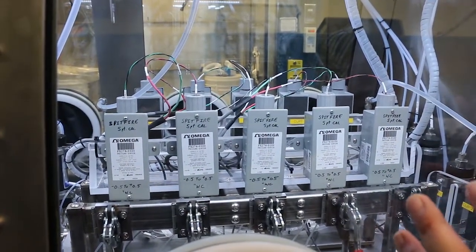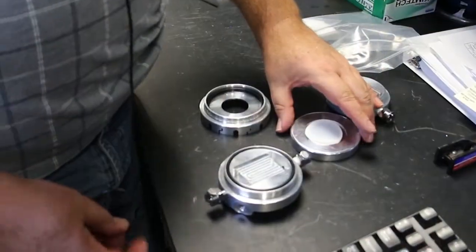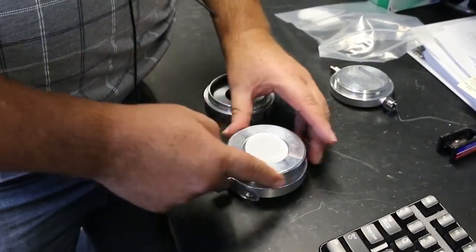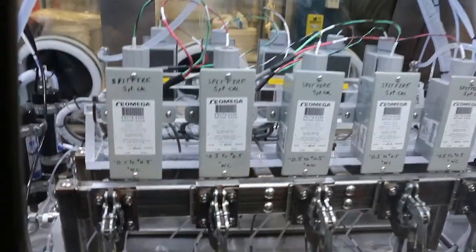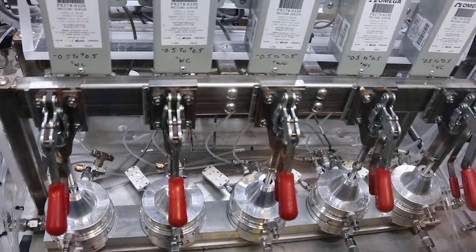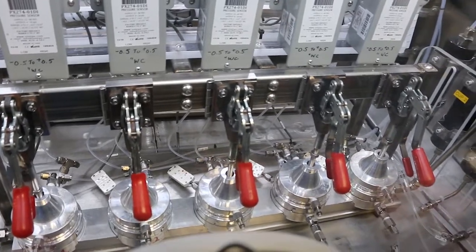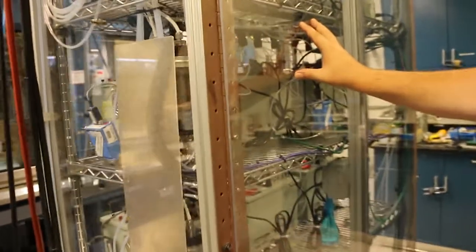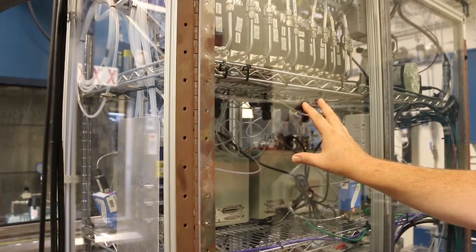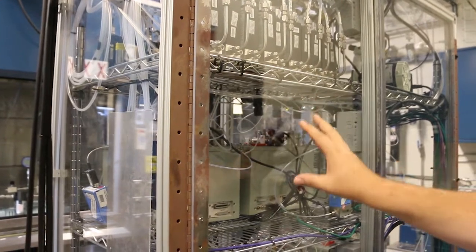So when we actually run a trial here, we bring a piece of material and we put it inside the little cup. The little cup is then coupled together and sealed with the red lever, and then we connect the lines, and those lines allow airflow to come through the cup and out to our chemical detection system, which is the MINICAMS. We can sample the cups over time and watch the chemicals slowly break through, and we capture the concentration of that breakthrough with this instrument.